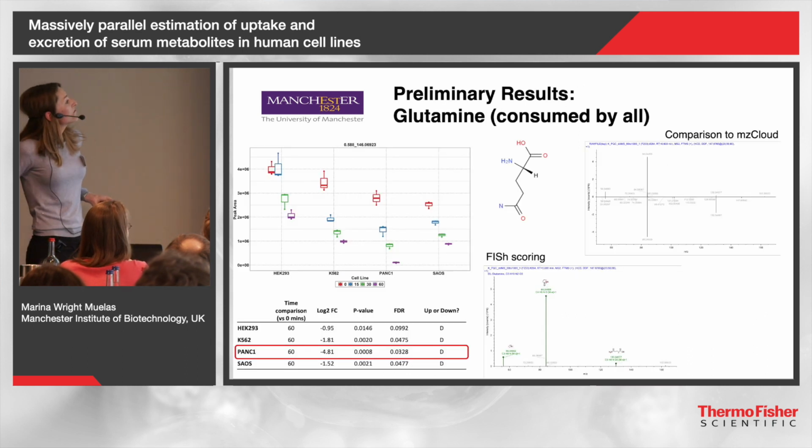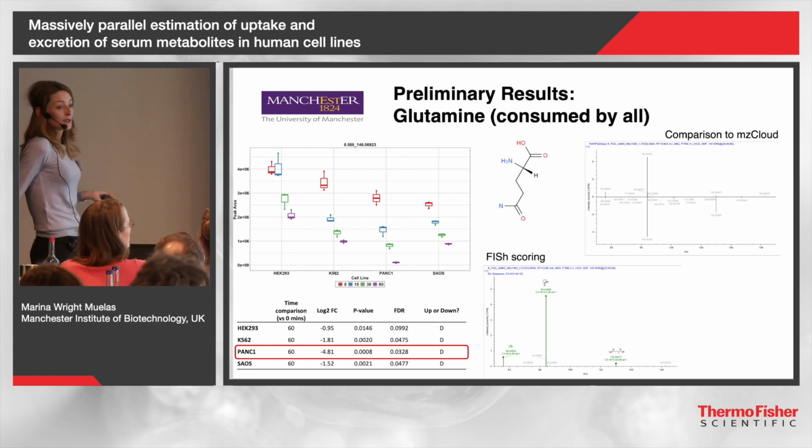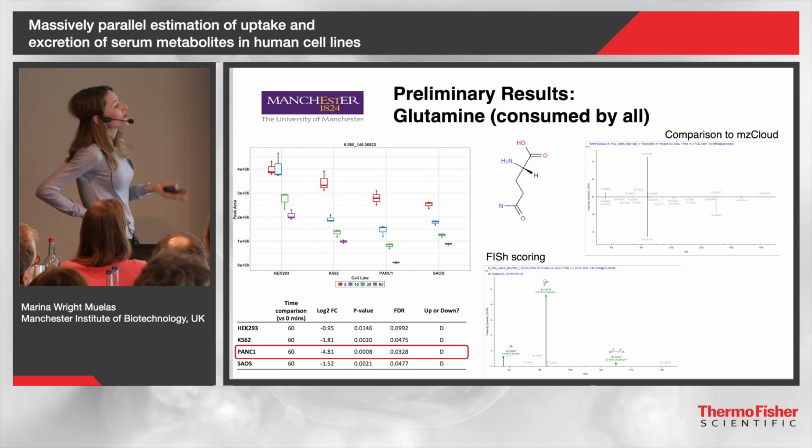So, thankfully, we see glutamine is consumed by all the cell lines. So at least they're not dead, they're actually alive, they're doing what they're meant to do. And it's a pretty good match on MZ Cloud and also with the fish scoring.